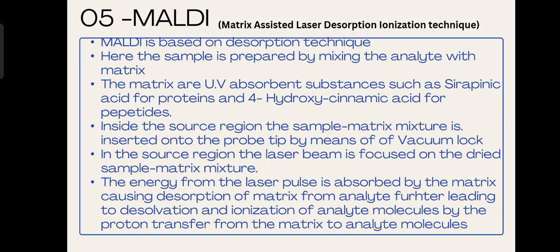Next is MALDI, that is matrix assisted laser desorption ionization technique. MALDI is one of the advanced ionization techniques which is commonly used nowadays, based on the desorption principle, wherein the sample is mixed with the matrix molecules.